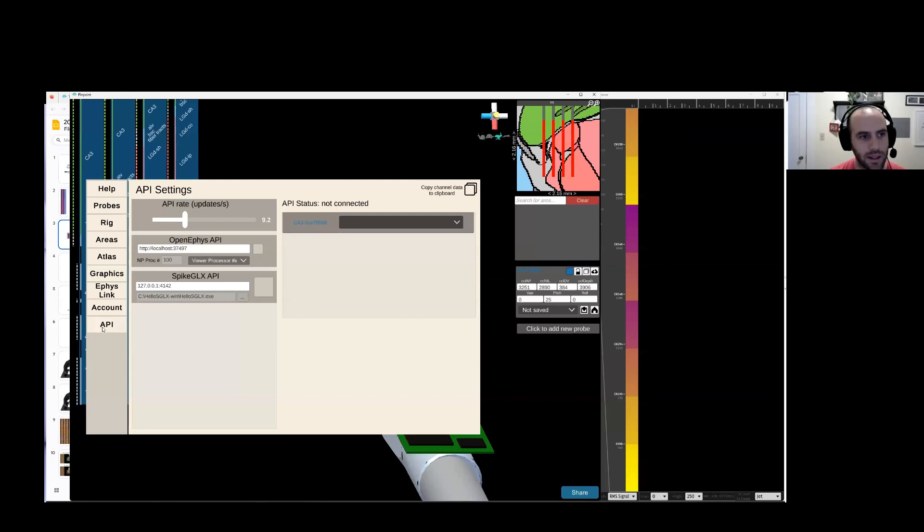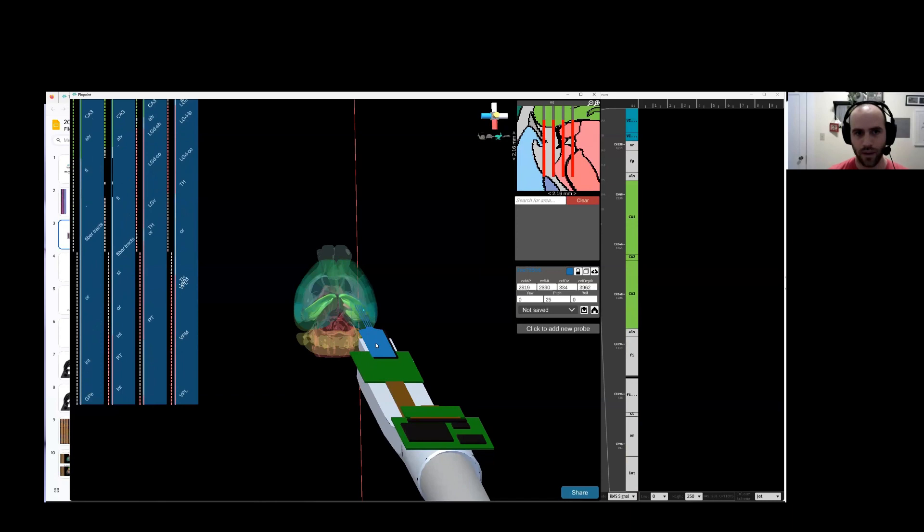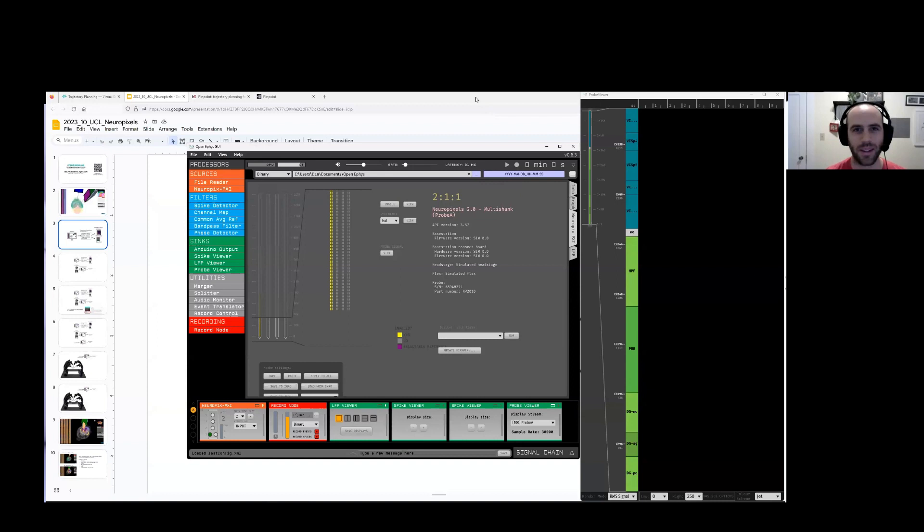And, again, you can go in the settings. You can go to API. You turn on this OpenEFIS API thing. You select which probe the Pinpoint probe is connected to in OpenEFIS. And it propagates that information over there. If you move the probe in Pinpoint, you're seeing the anatomical information here update in the OpenEFIS GUI as well. So just letting you know that that system works in both systems. It's a feature that we've been working on together for a while now.